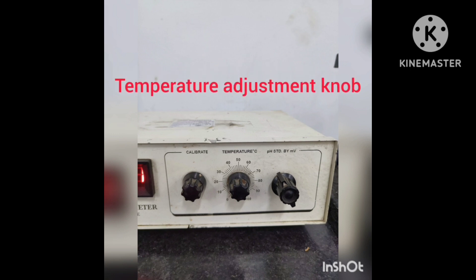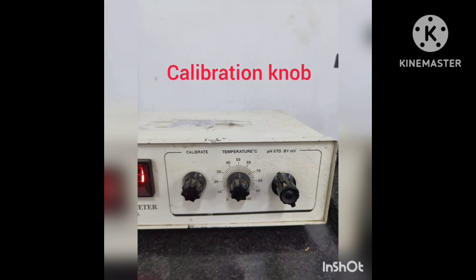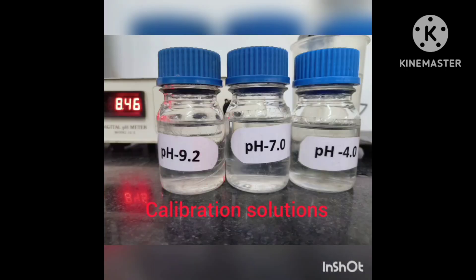The second knob is for temperature regulation. The temperature is adjusted according to the room temperature. The third knob is for calibration of the calibration solution.